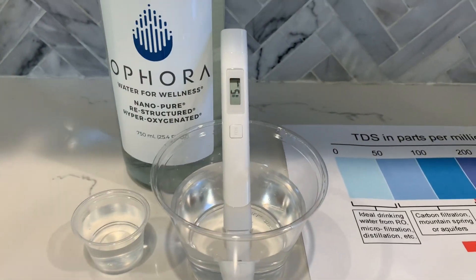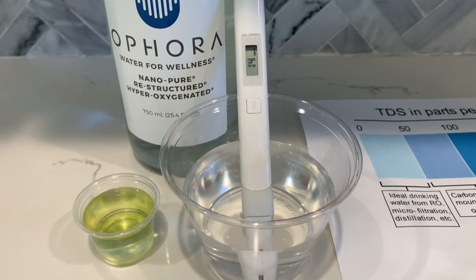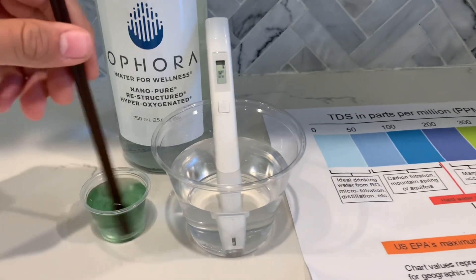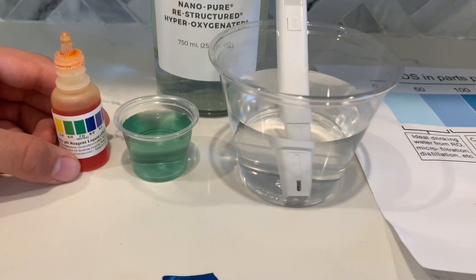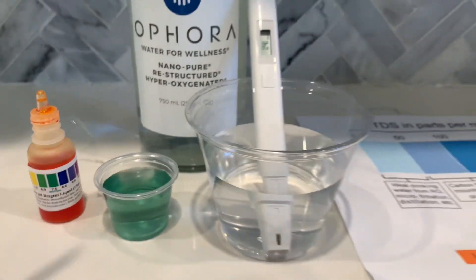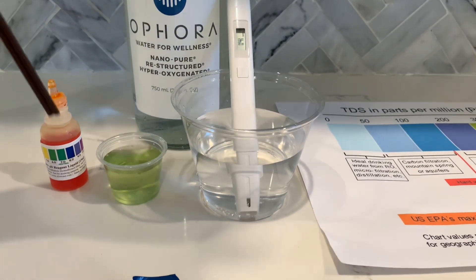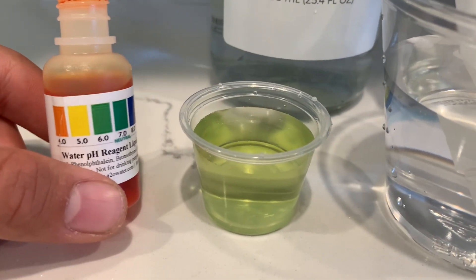Now, let's test the pH level. Do two to three drops. Let's stir it all for a better result. Before blowing onto the water for a better result, it is around a 7. It got a little lighter, to a 6 to a 5.5.